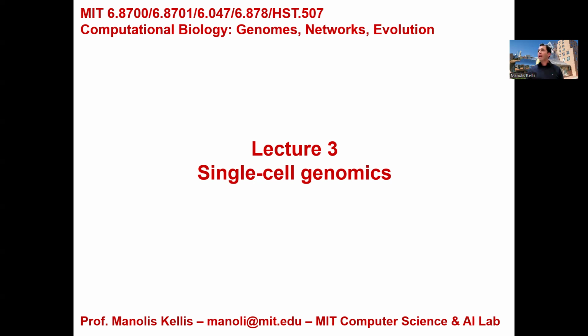Why are we doing this? So that as you start thinking about your final projects, you have all of the tools at your disposal. And a lot of people have talked about single-cell genomics in their projects. So we want to enable and empower all of you to be able to carry out all of these single-cell analyses, which are frankly a lot of the frontiers of where biology is right now. A lot of mysteries of how the genome works and how disease impacts the body are very difficult to uncover when you're looking at bulk analysis. However, the moment you're able to separate the different cell types in the body, things become much more amenable to these types of analysis. So let's dive right in.